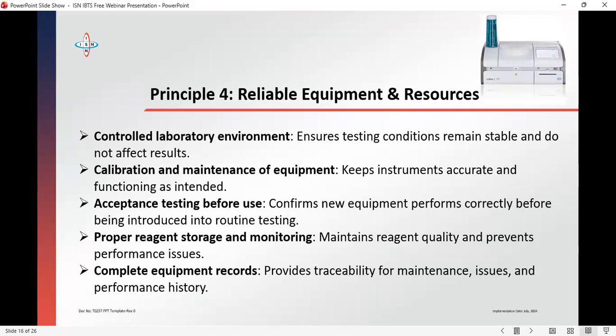According to the CLSI guideline, you should at least calibrate your pipette once a year to ensure that it is pipetting the correct volume. You know how you have doors in the house? During the dry season, you find out that any small breeze, it will be making sound, or if you jam one door, it will open another door. But during the rainy season, it doesn't happen. Why do you think that is so? It's because of moisture. When dry season or dry weather comes, especially for those homes that have wood doors, it shrinks and expands. So also our pipettes.